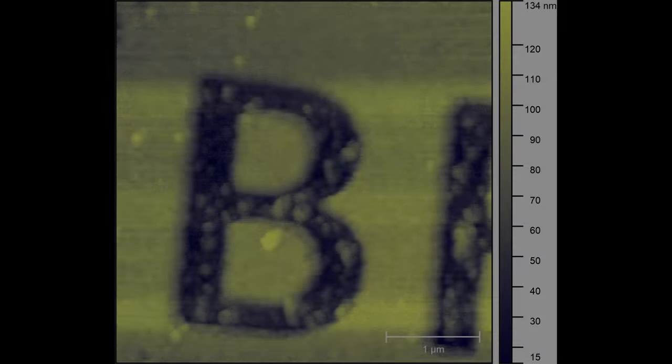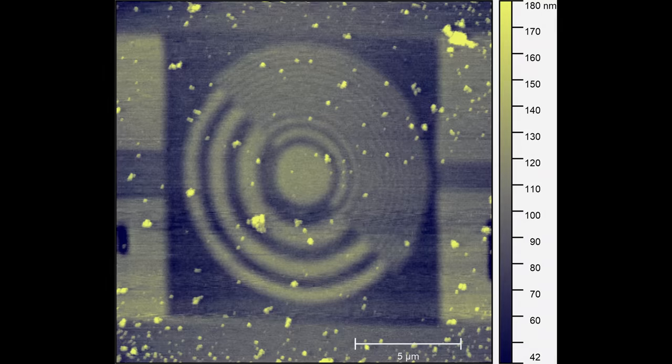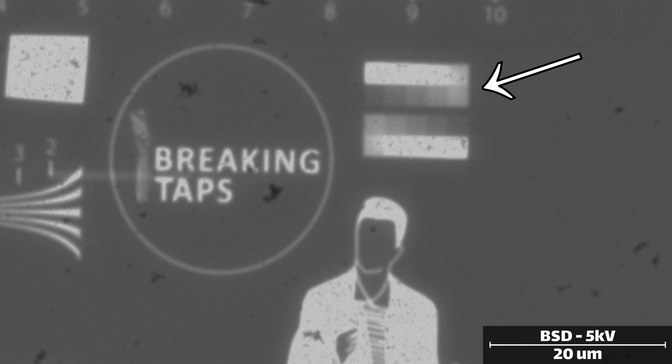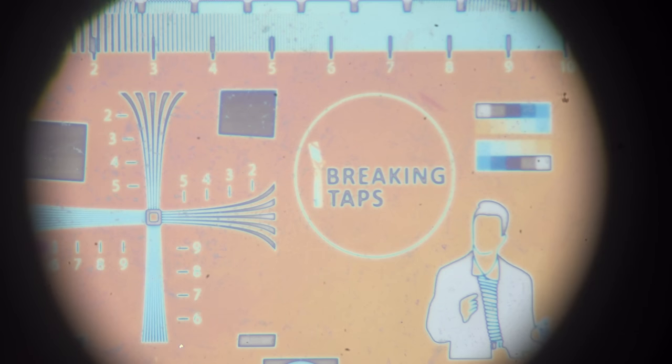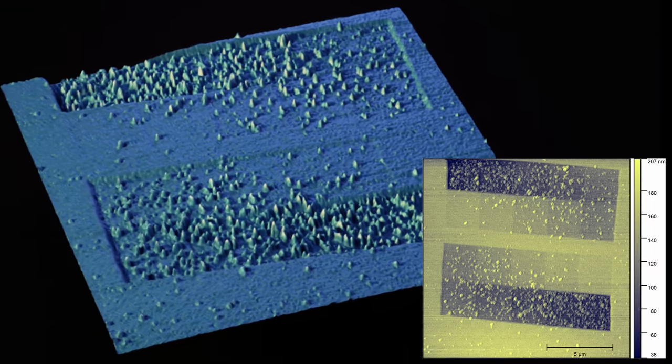The contamination issue should clear up by using a PMMA designed for lithography with defined molecular weights, rather than injection molding resin. A neat thing about this process is that it's dose-dependent — the more electrons you hit a region with, the more the resist gets broken up from the top down. By varying the dose per region, you can get different levels of resist removal. In test grids, you can visually see different amounts etched away, and the AFM confirms they are in fact different heights.